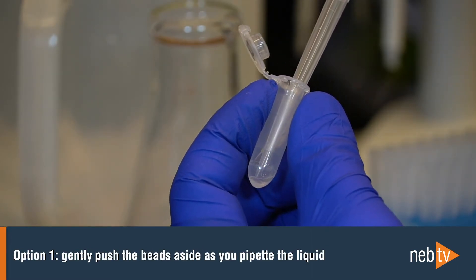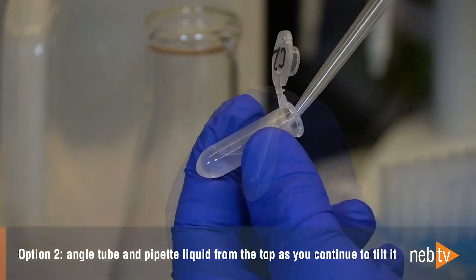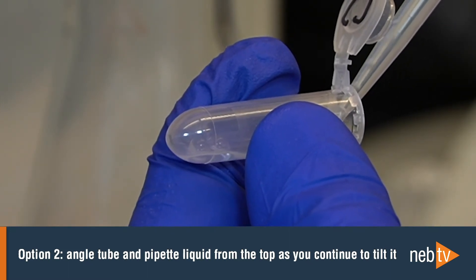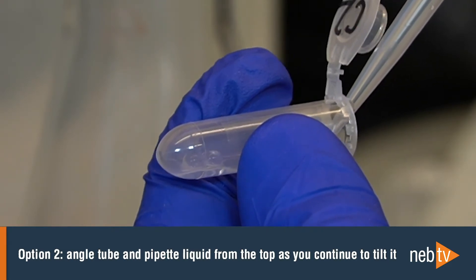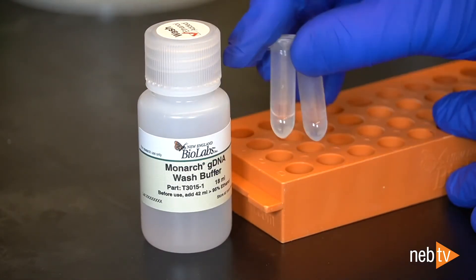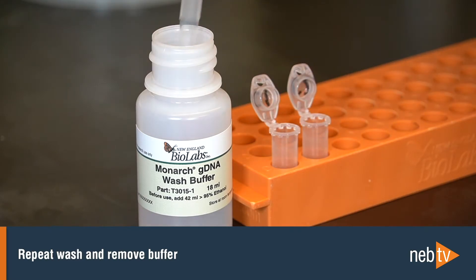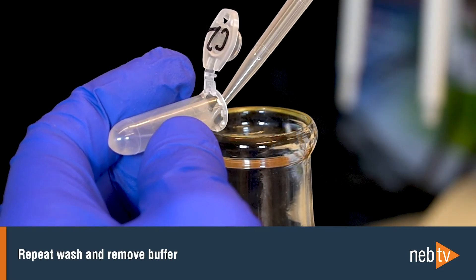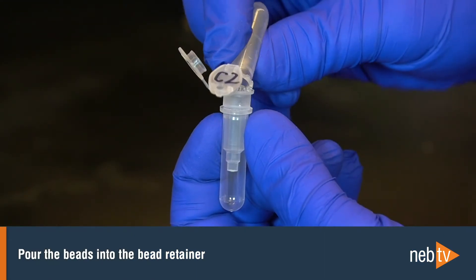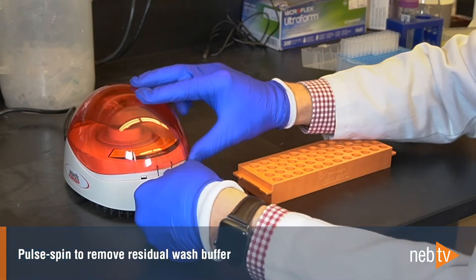The first option is to keep the tube upright and insert the pipette tip, gently pushing the beads aside to remove the liquid. The second way is to angle the tube so that the beads remain at the bottom and the liquid reaches toward the tube opening, then pipette the liquid from the surface and continue to tilt the tube as you remove the liquid. Add 500 microliters of gDNA wash buffer, close the cap, and mix by inverting two to three times. Then remove the wash buffer by pipetting. Repeat this wash step and once again remove the buffer — this time you can pour the buffer out, using the pipette tip to ensure that the beads stay in the tube. Make sure the bead retainer is inserted into a collection tube and pour the beads into the bead retainer. Discard the used 2 mL tube. A quick pulse spin removes residual wash buffer efficiently and there is no drying step necessary.